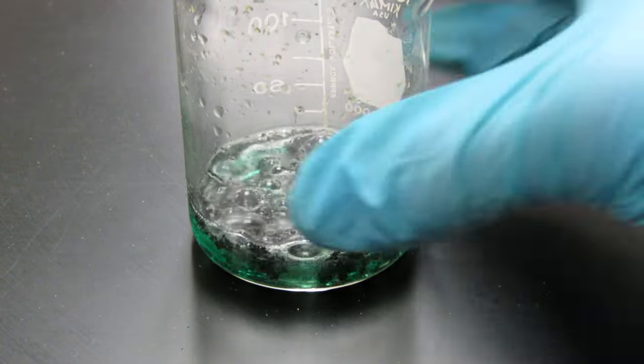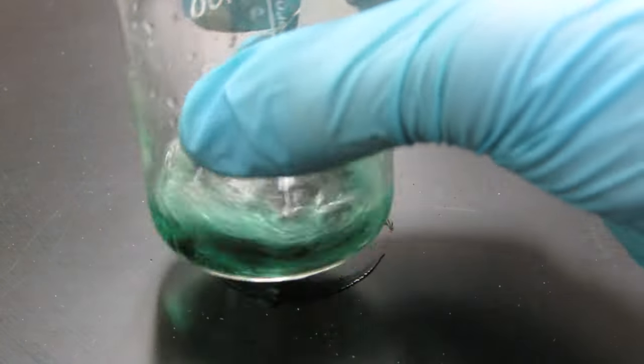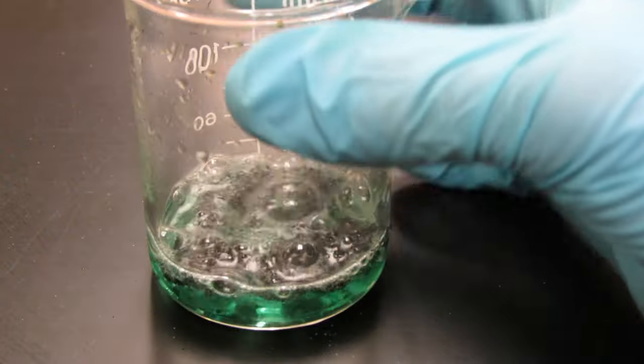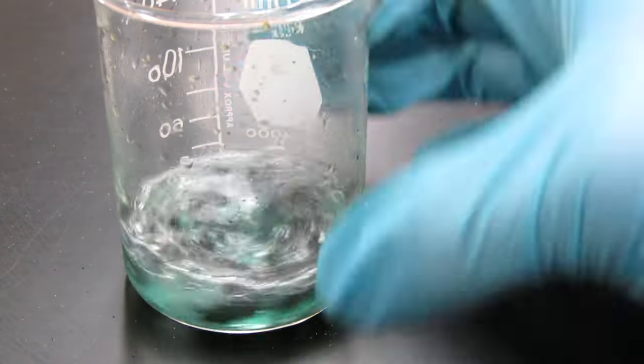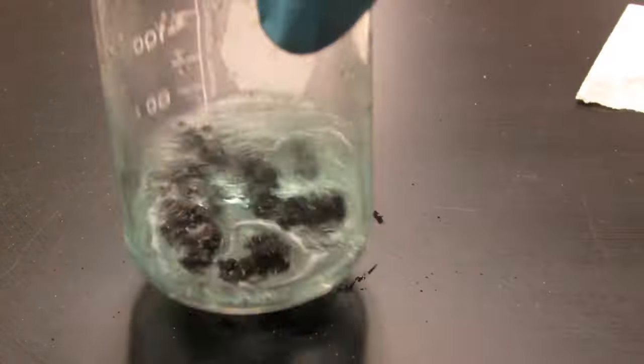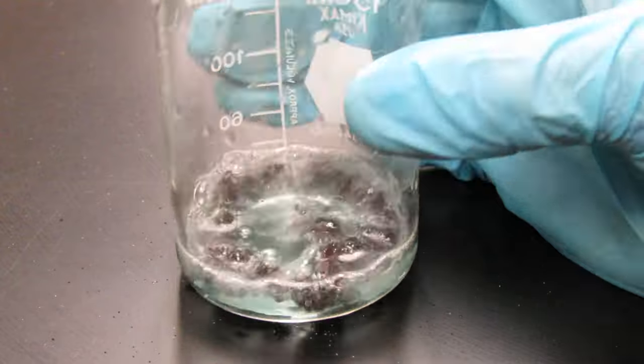What's happening is the zinc is more active, so it's taking the place of the copper metal and forming zinc chloride. As you can see, the copper chloride color is going away and becoming clear.